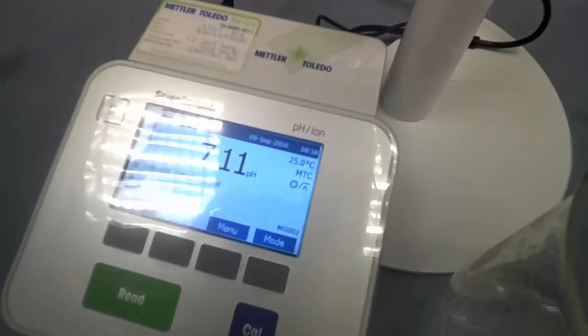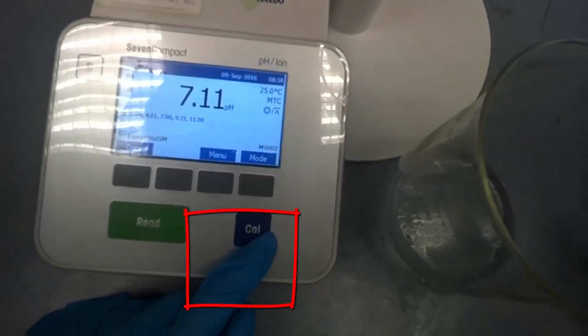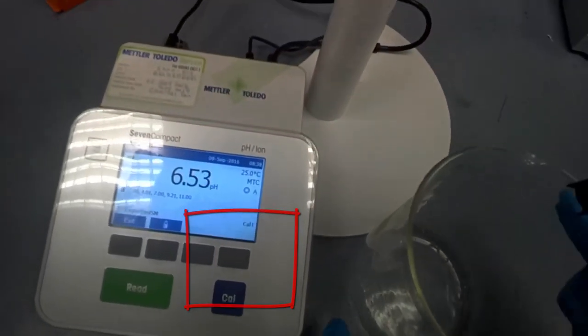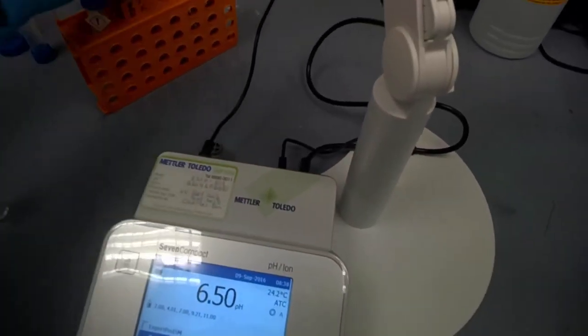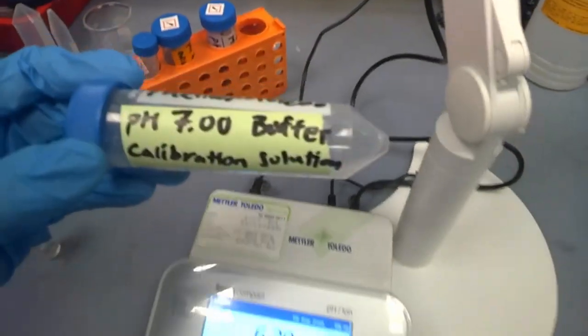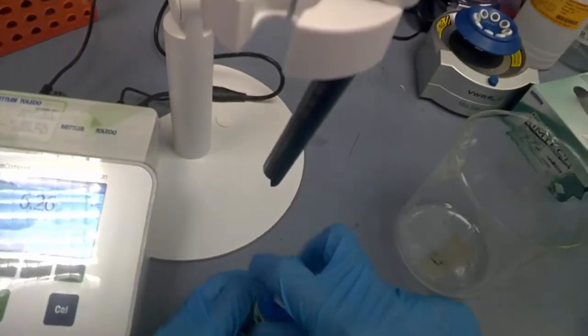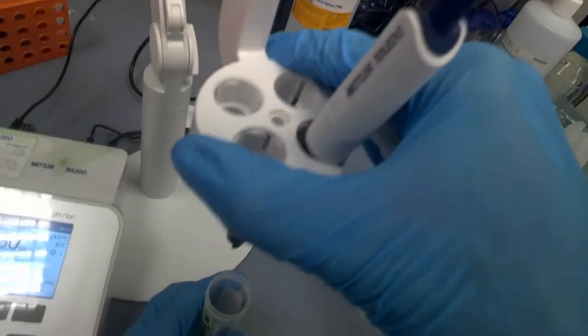And then next, we press calibration. This is CAL, calibration. Press CAL, and we start with pH 7. So that's the buffer. We will put the arm inside there.